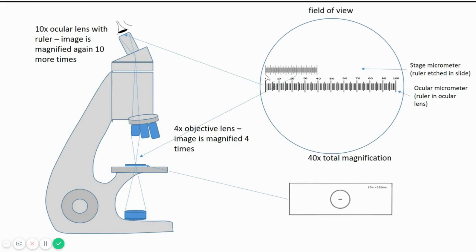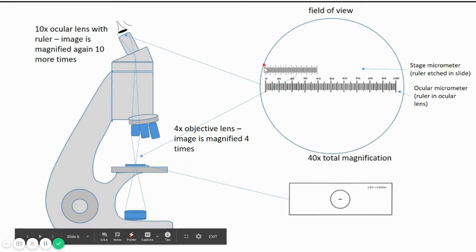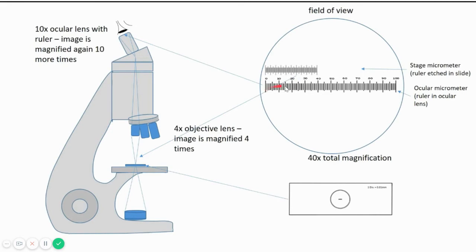Why did I do that? Because I want to superimpose the stage micrometer's zero with the eyepiece graticule zero mark, so that at least the starting divisions will correspondingly coincide with each other. After I align the zeros of both the scales, then my job is to find which is the other division which is completely aligning. I am going to find another division on this scale and another division on this scale, apart from the zeros, which will coincide just like the zeros are coinciding.